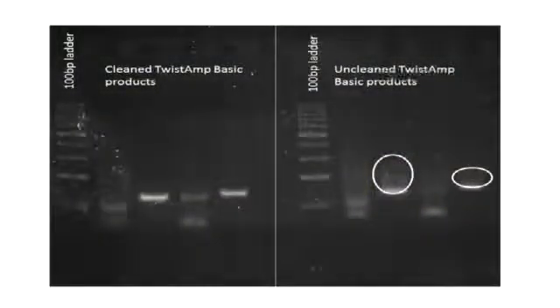This gel has been loaded with positive and negative RPA reactions that have either been cleaned up on the left, or have not been cleaned up on the right. As you can see, cleaning up the DNA results in a cleaner gel with better resolution of the RPA product. For some reactions the smearing can be more extreme than shown here. In all instances, you may observe, as with PCR, formation of primer dimers — this is nothing to be concerned about.